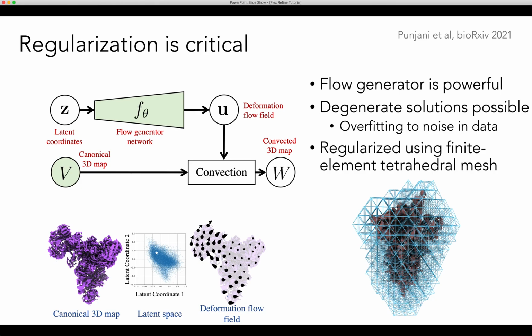They are also very close together, and the faces between the domains can move apart, closer together, farther apart, or in a shear-like motion relative to the other domains. And this is where the default continuous mesh that the 3D Flex mesh preparation job creates becomes a problem.